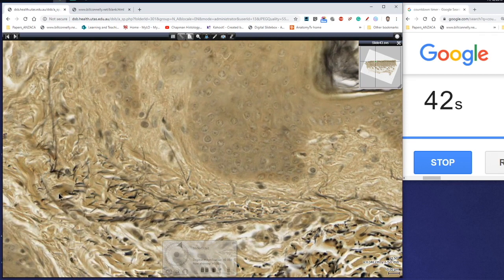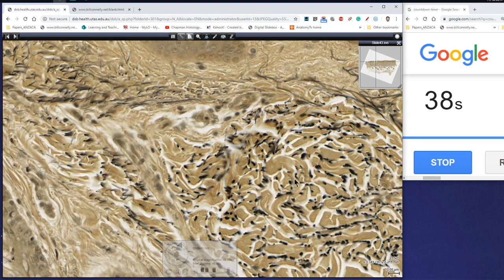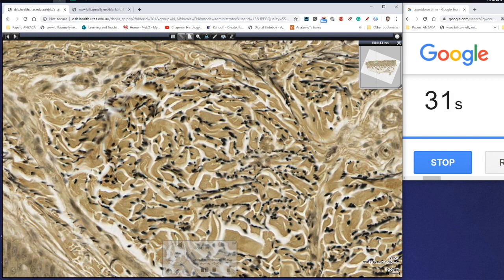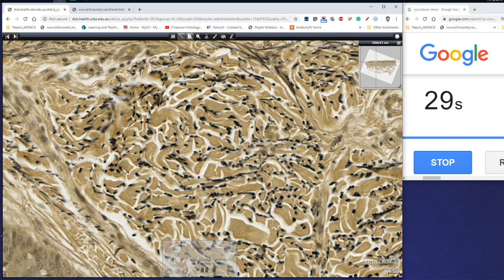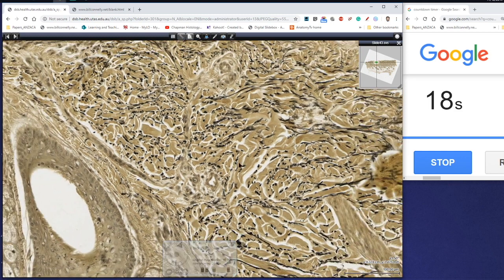You can see them stretching up here — very thin, wriggly type of fibers. But out here in the denser irregular connective tissue, following the collagen, they're running in many different directions — you can see them in longitudinal, oblique, and transverse section — indicating they're also providing an ability to withstand forces from many different directions.